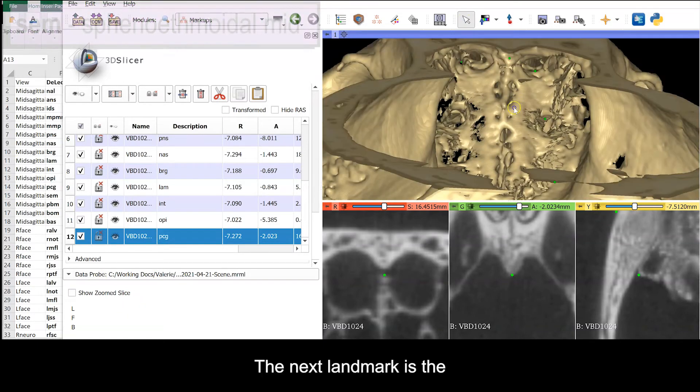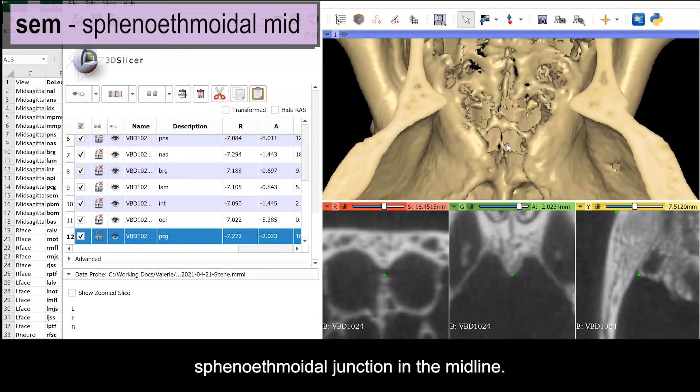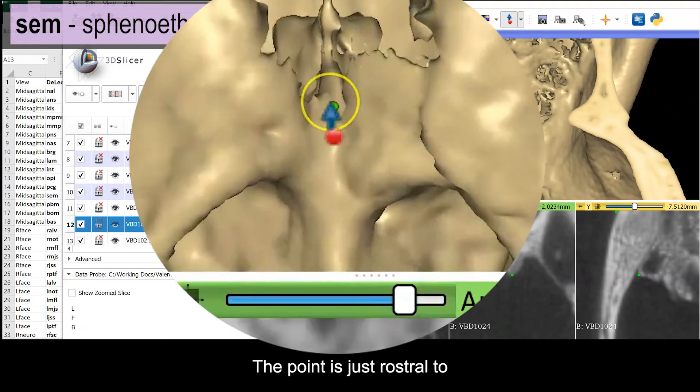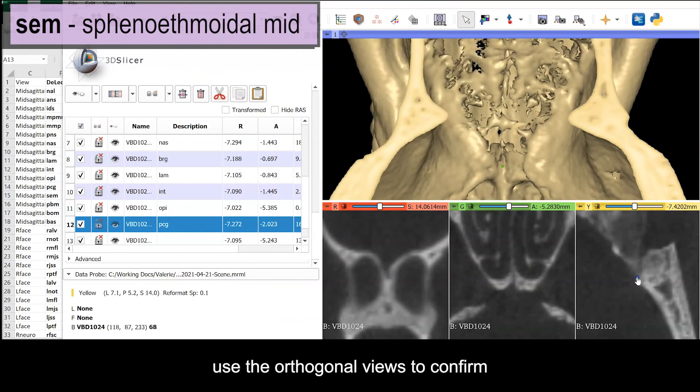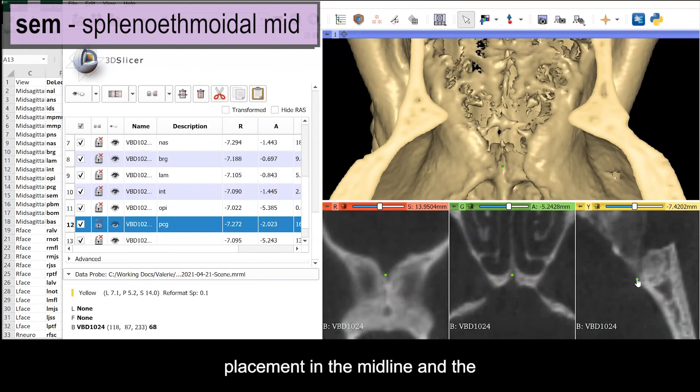The next landmark is the sphenoethmoidal junction in the midline. The point is just rostral to the optic canals. Here again, use your orthogonal views to confirm placement in the midline and the sagittal view in particular to be sure the point is at the junction between the sphenoid and ethmoid.